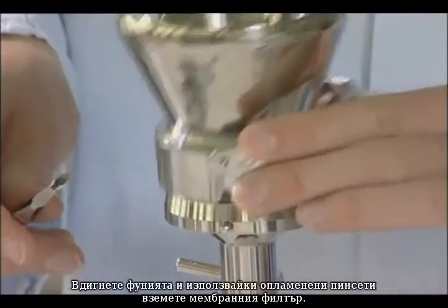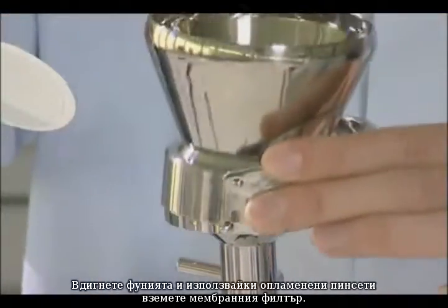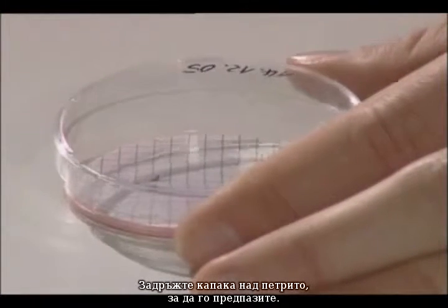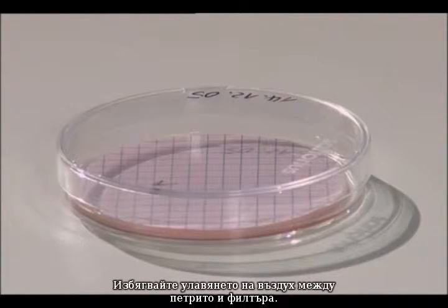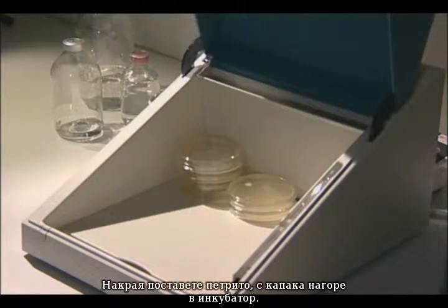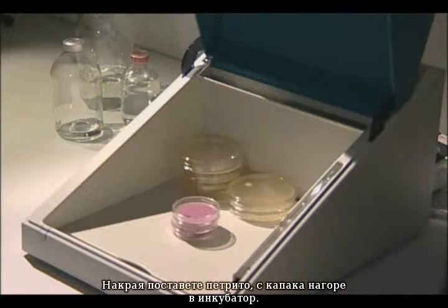Lift off the funnel and, using flamed forceps, remove the membrane filter. Place the filter on the wetted nutrient pad. Hold the cover over the petri dish to protect it. Avoid entrapping air between the pad and filter. Finally, place the petri dishes with the cover facing upwards in the incubator.